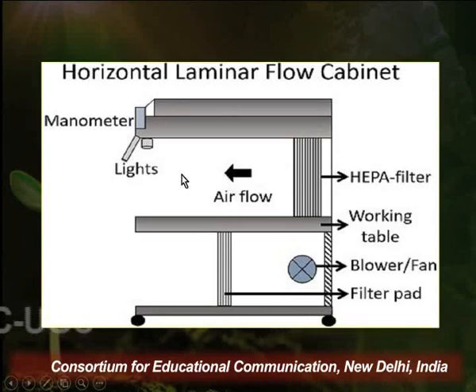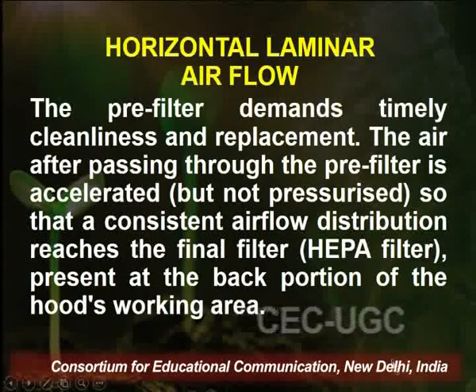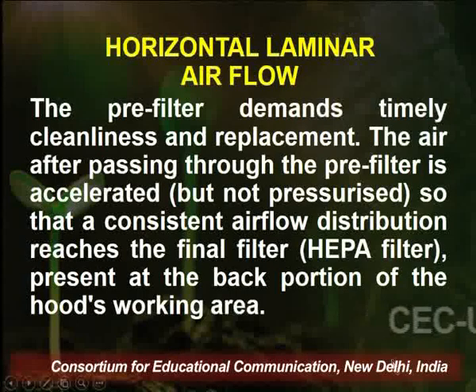Because of this horizontal direction of airflow, this design of laminar flow cabinet is called a horizontal laminar flow cabinet. So how it works: the pre-filter demands timely cleaning and replacement.